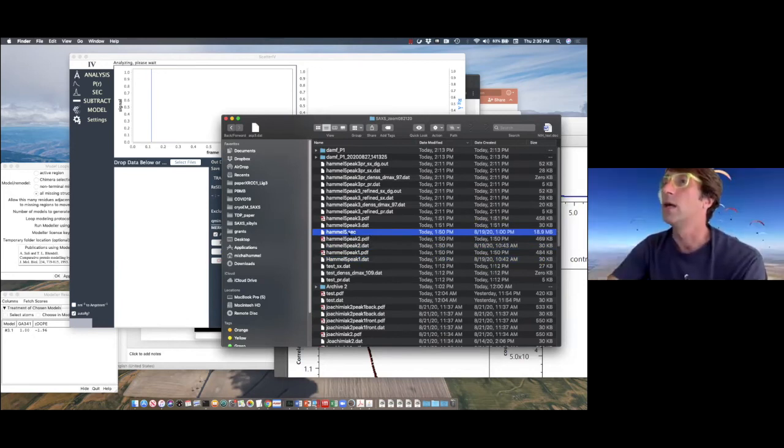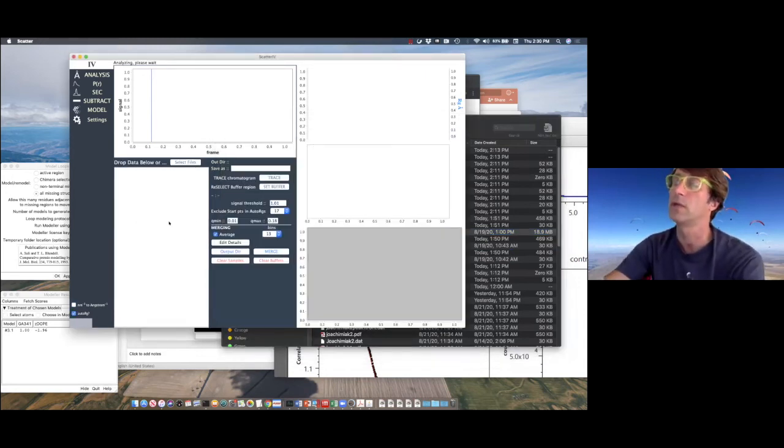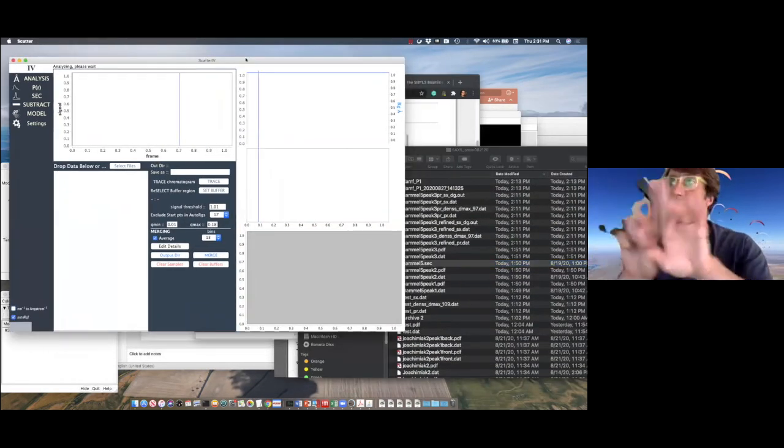Okay. Well, I just really want to go to the deconvolution of the size exclusion. I think that was in one of the questions from the users who raised their hand. And I think I covered the ab initio shaping a little bit, showed a little bit of BilboMD, and also FoXS, how easy it is to calculate scattering profiles. Okay, so let's go to deconvoluting this very close peak.